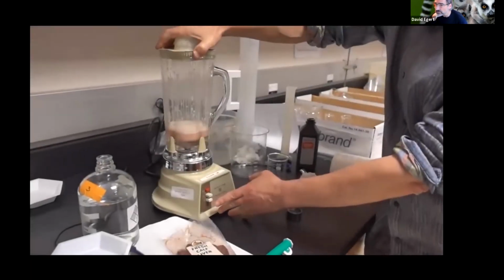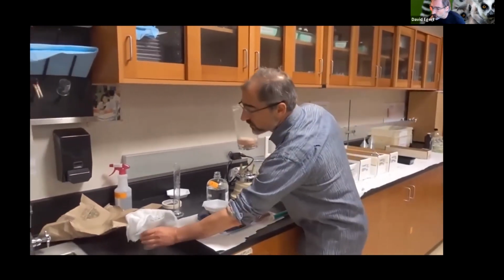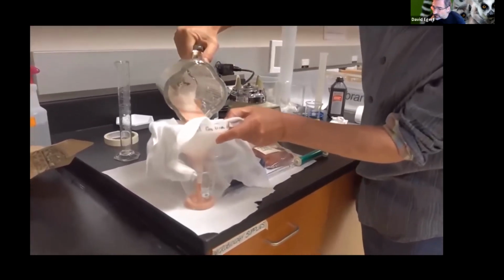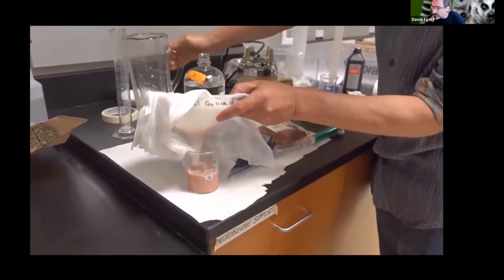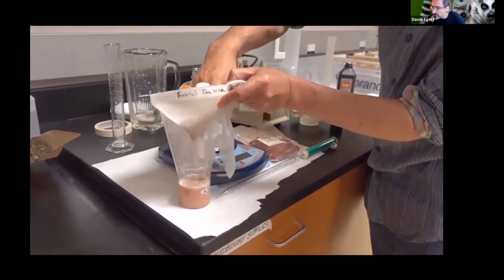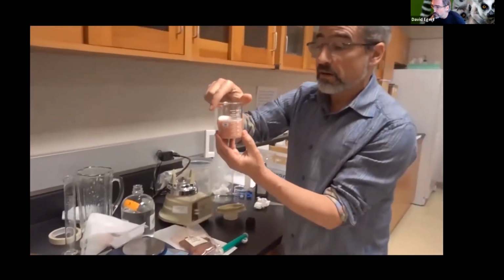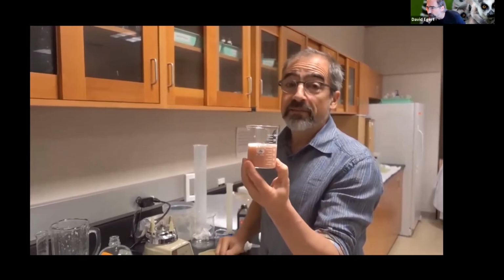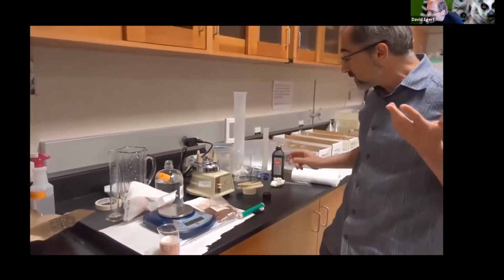All right, so now we've made our liver smoothie here. Now we can strain it. I've got some cheesecloth here, and I'm just going to pour it through here and collect it. Ooey gooey. So here is our little extract of the liver. And obviously this is going to have the enzyme, but I can show you an example so we can test. Does it actually work?